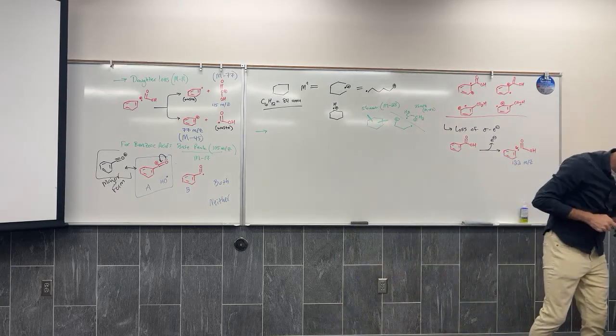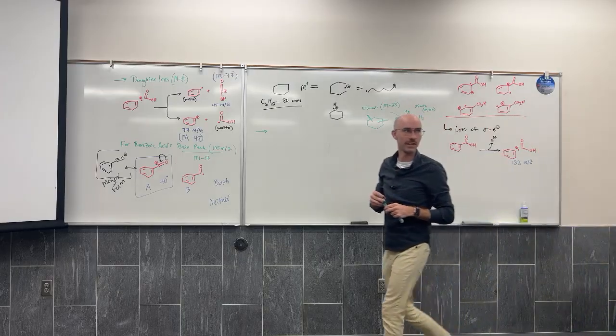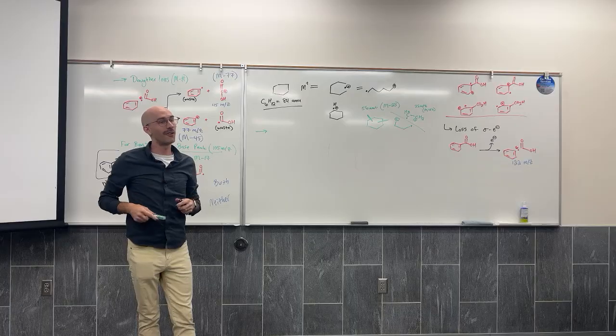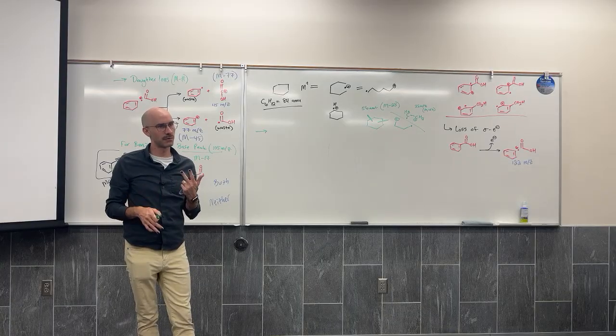Do we have a signal at 28? Barely. Very small one. Wouldn't it have to be equivalent to the base peak? No, yeah, you'd think, right? But no, they don't always have to form in equivalent ways.